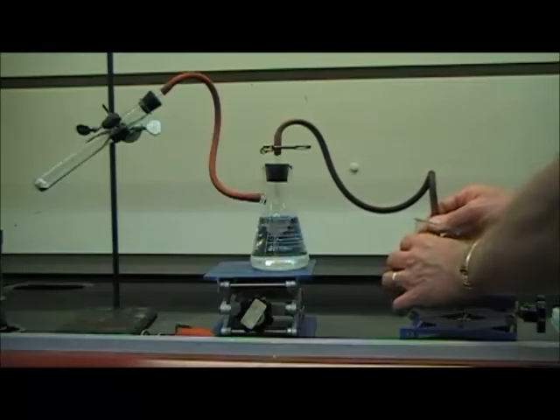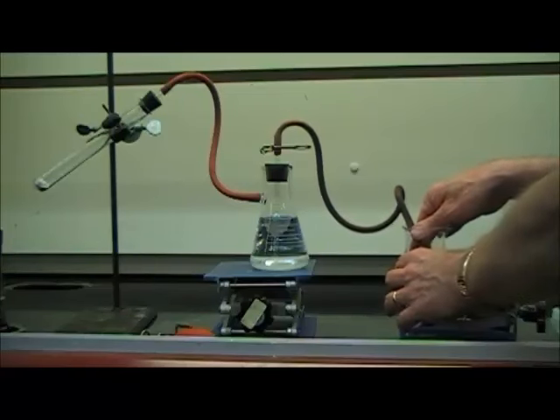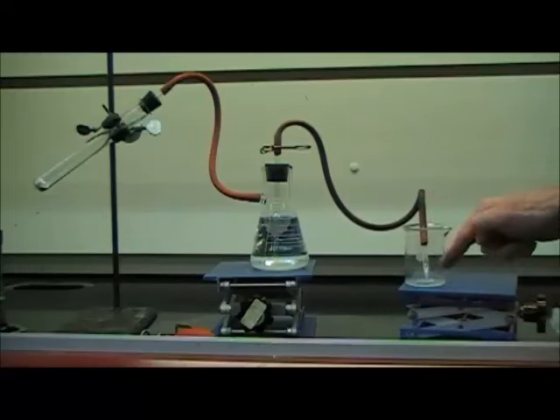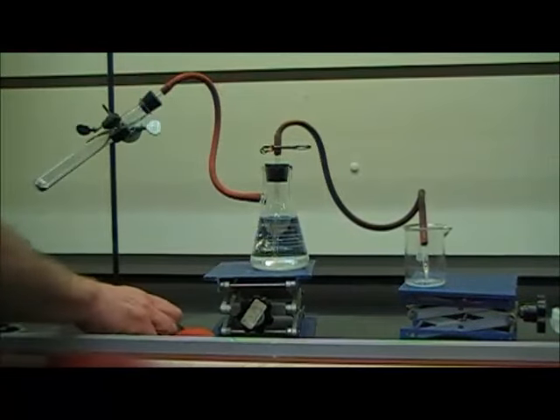I'm going to carefully hold the tip of that pipette under the water in the beaker. And as long as that tip stays underwater, no air can get up in there, and we're fine. That's what we want to happen. Now, at this point, I'm going to light the Bunsen burner.